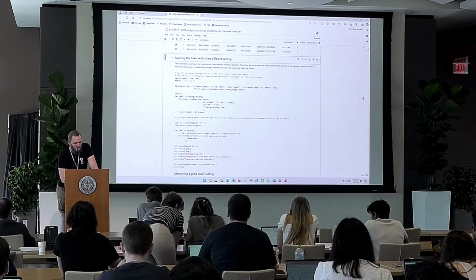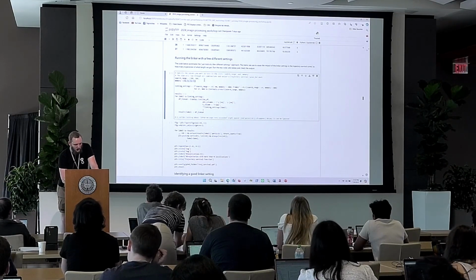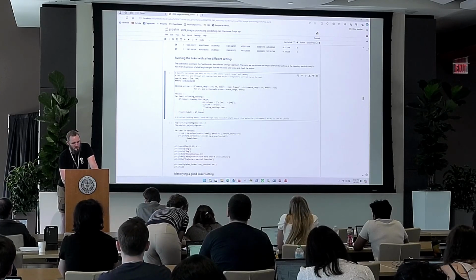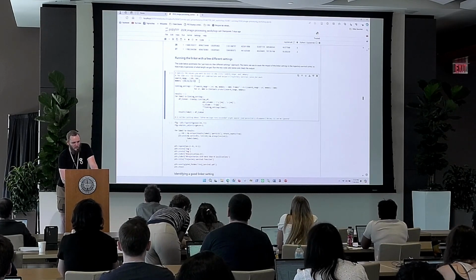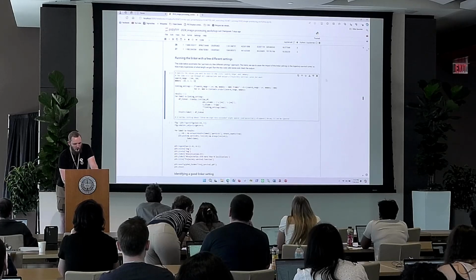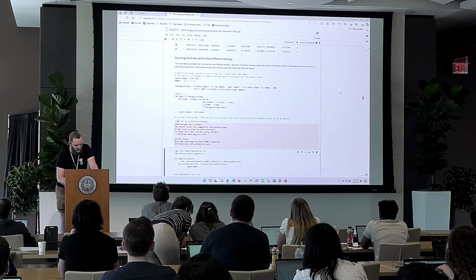What I generally do is run this with a few different settings, and then look at the results. Here I'm saying, let's do search ranges of 200 or 300 nanometers, and run the linker with a memory of 0, 1, 2, or 3 frames. So this is going to be a total of 8 runs of the linker, and then we're going to look at the results. This takes a few seconds to execute.